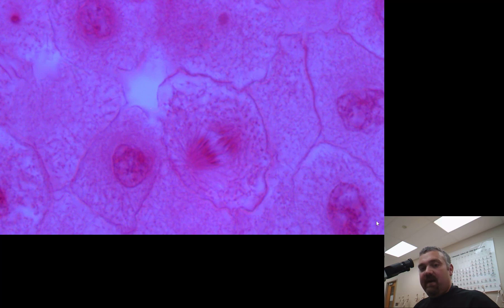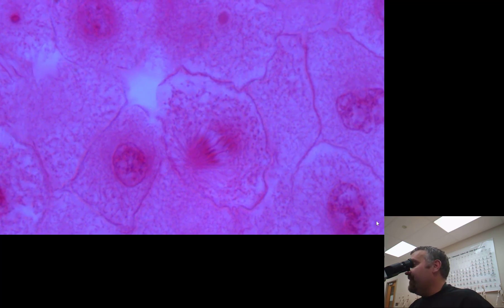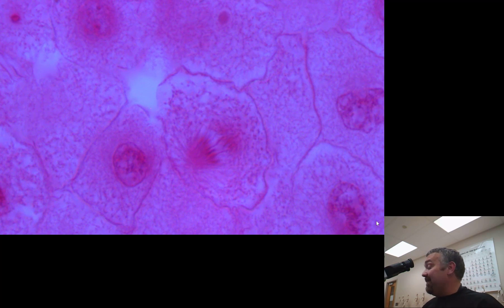I'm going to slowly move the oil immersion objective here. This is going to give me a total magnification of 1,000x on this microscope. You can go higher than that. But here again, we see individual cells undergoing mitosis. And that is so cool.